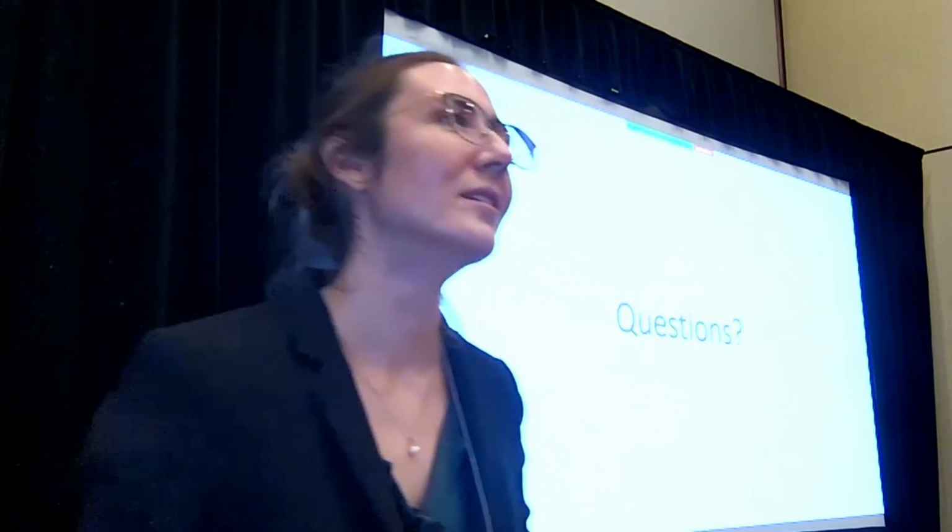Darci, I wanted to ask a question. What do you think about designing experiments when we're thinking about herbicides and before and after treatment and what time points? I know you've worked with these kind of data sets a lot. What kind of things should people think about as far as that part of their sampling design?